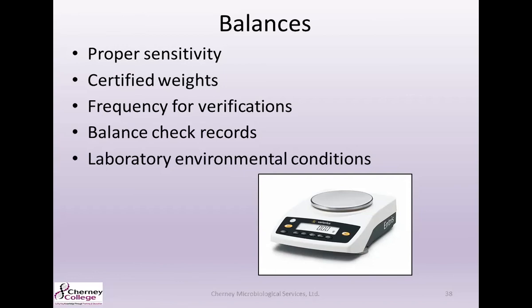Another thing to keep in mind with balances is you want the appropriate laboratory environmental conditions. What I'm talking about here is temperature and humidity. And both of those things can come into play with balances.